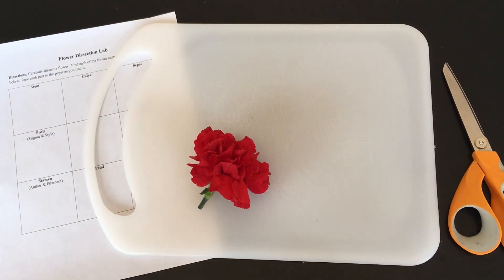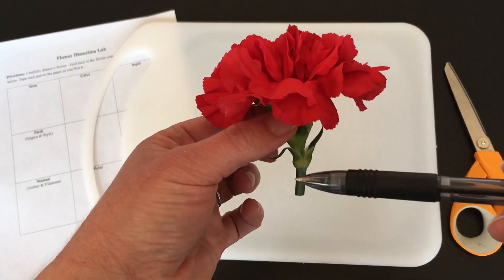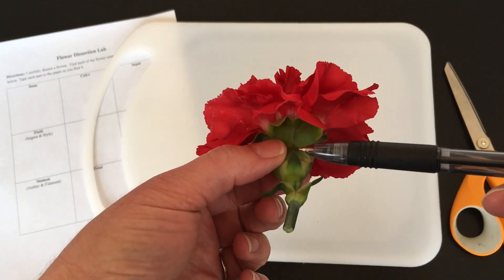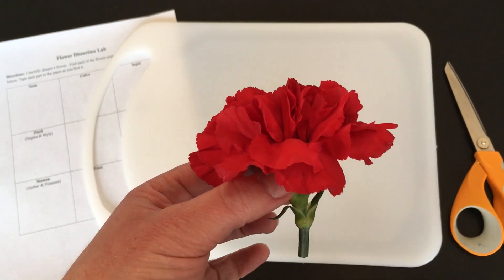To start off with, I'm going to identify all of the external anatomy. Here we have the stem, under here we have the calyx, and you can also see the petals. But we can't see anything else just yet.